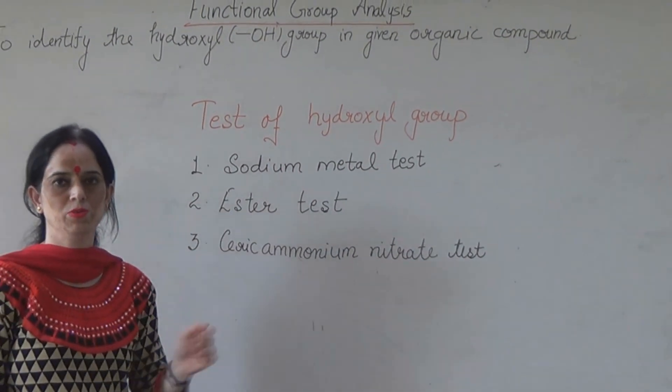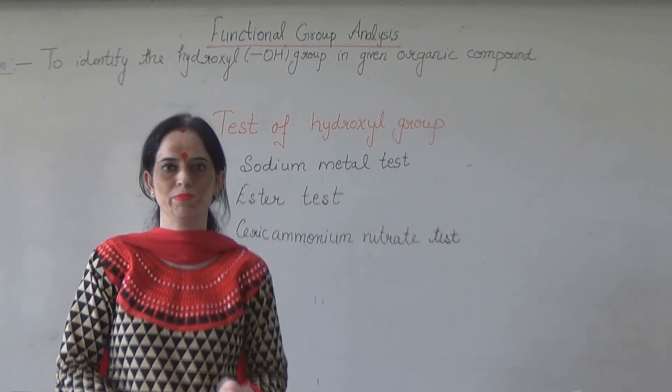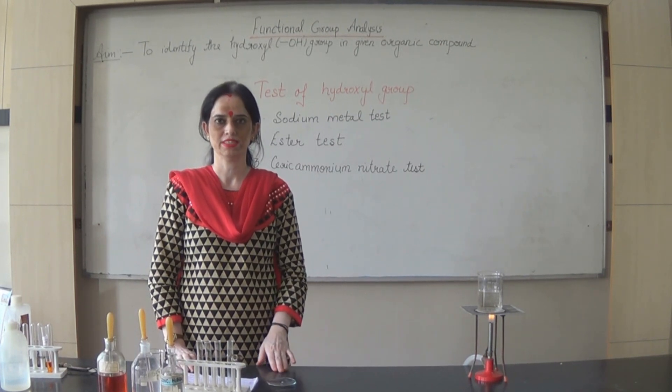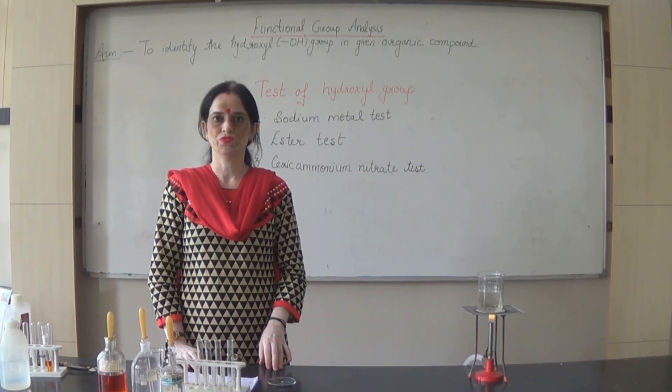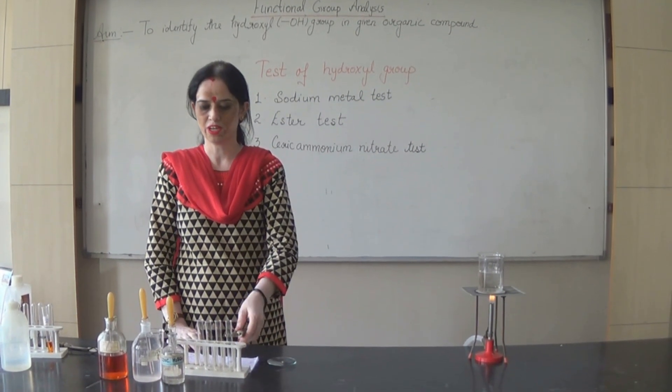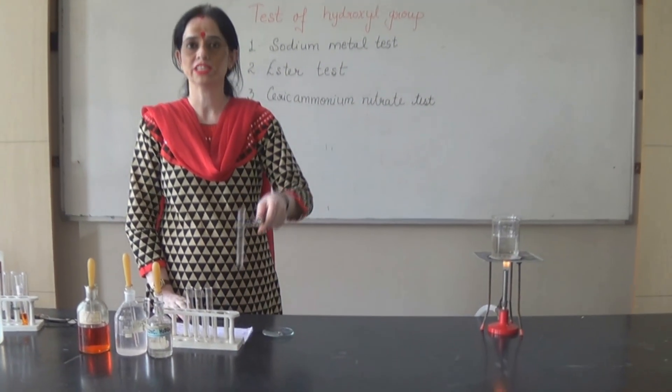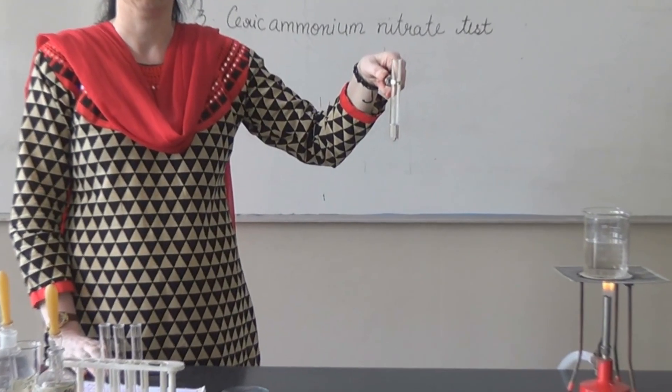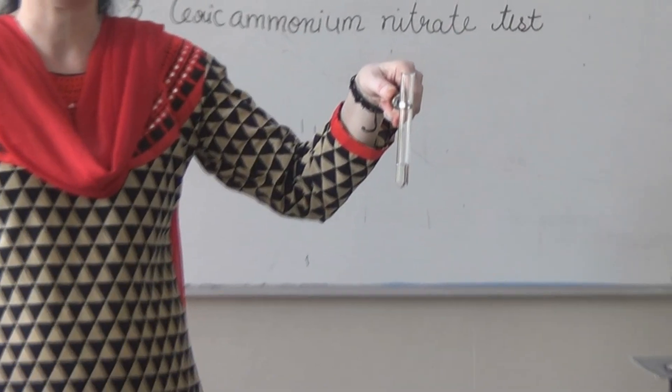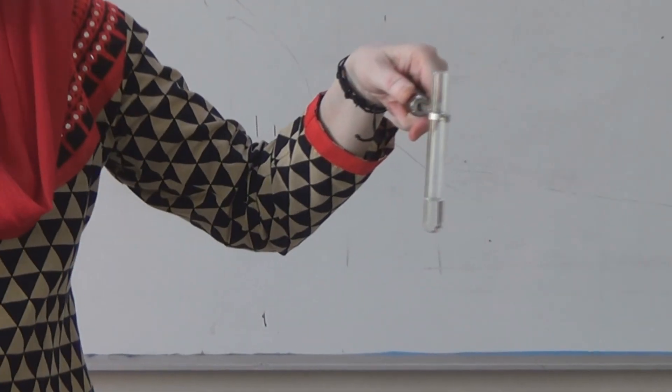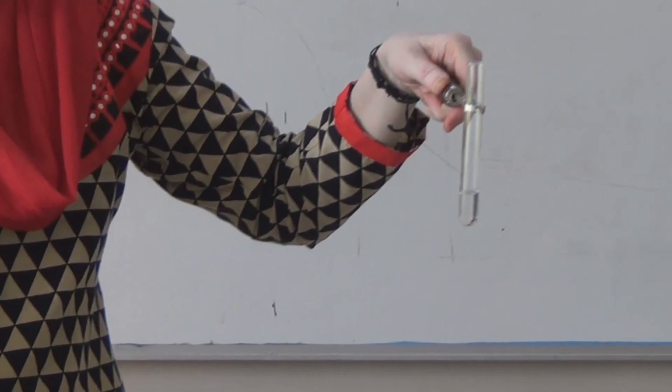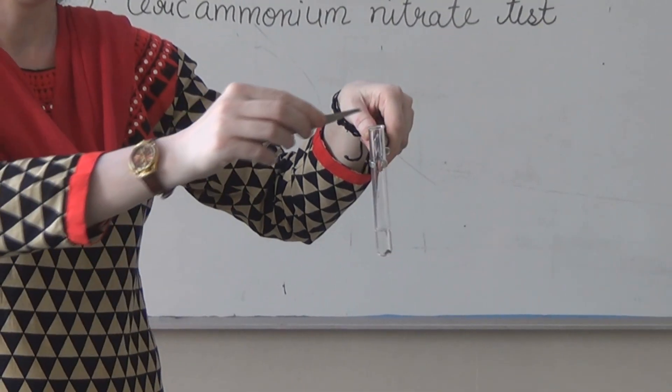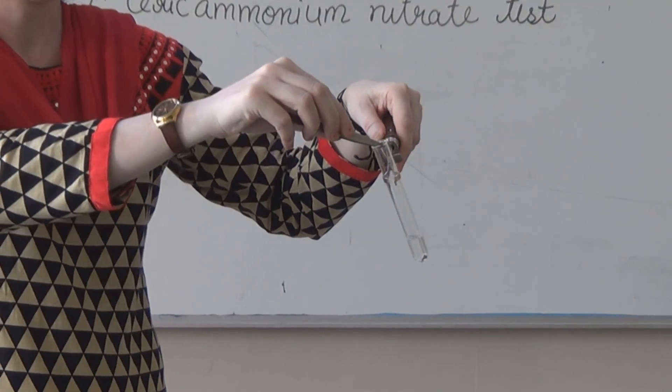Now we are going to perform these experiments one by one. We will proceed for experiment number one, that is sodium metal test. First of all, we are required to have a very small amount of organic compound in the test tube. In sodium metal test, take a dry, very small piece of sodium metal and add it to the organic compound very carefully.